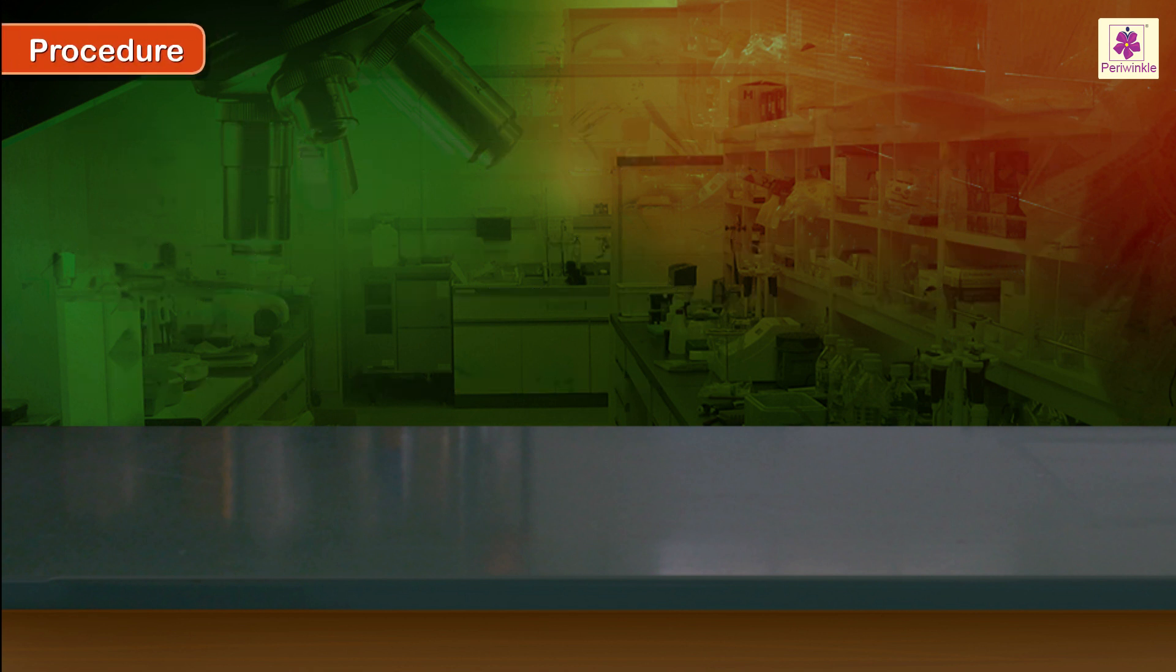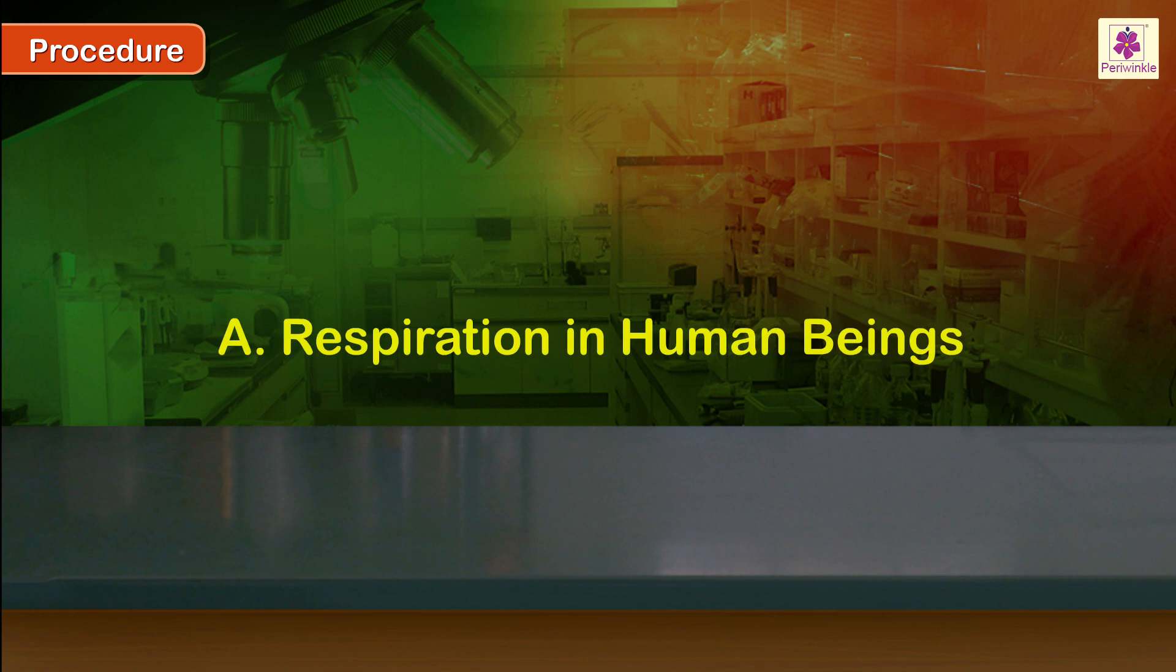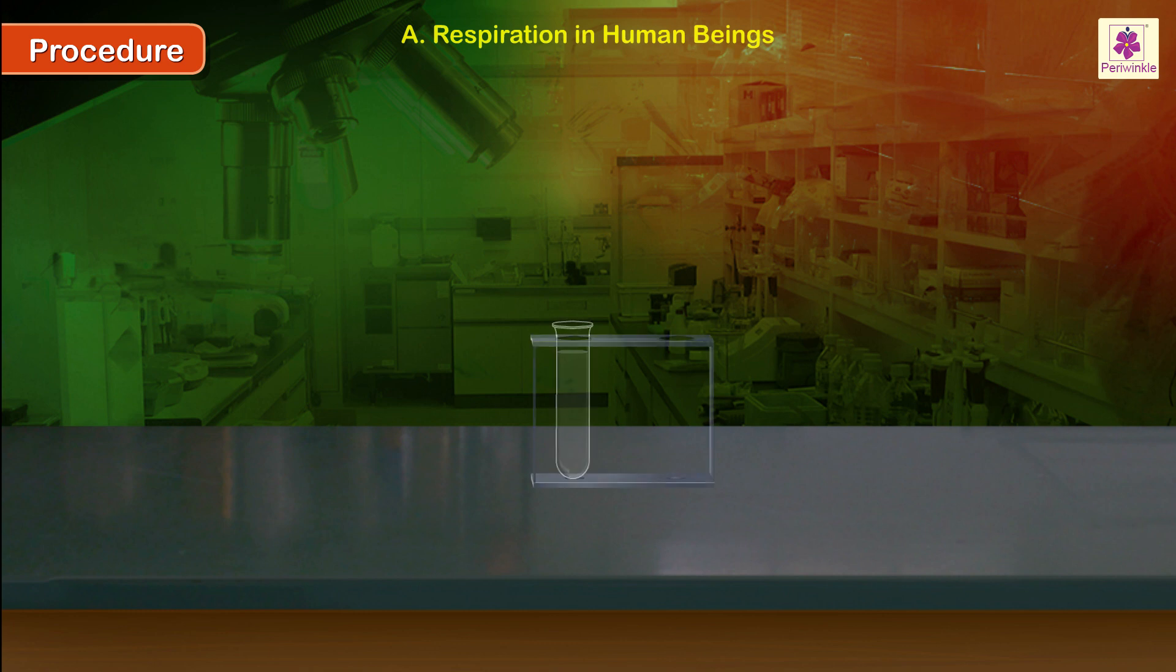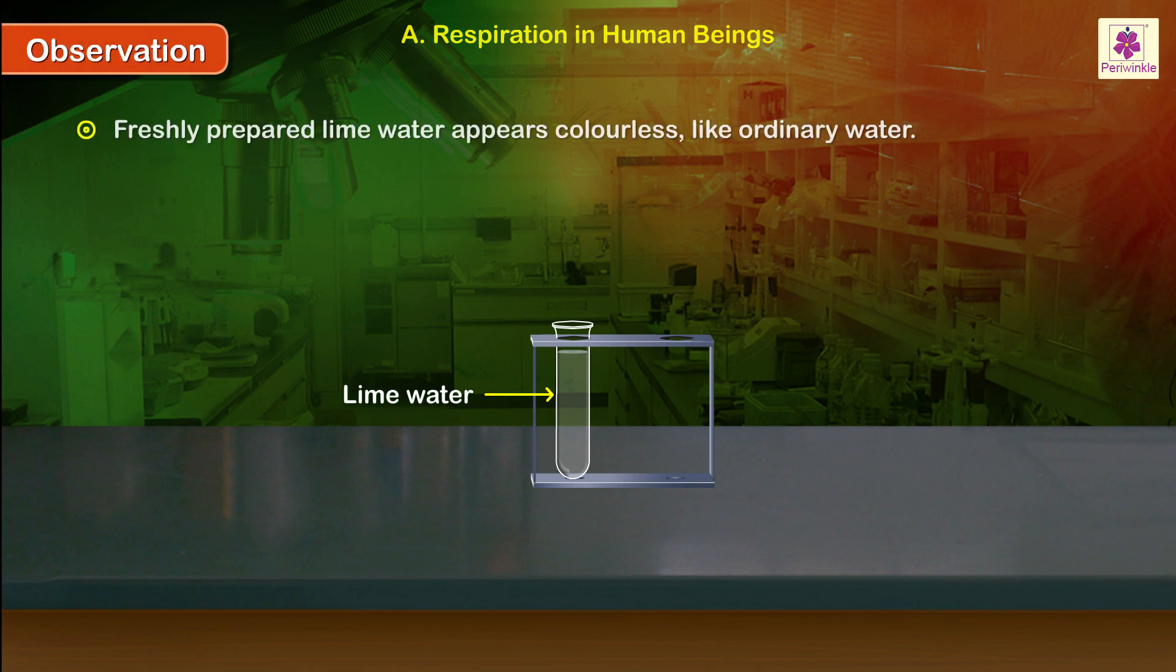Procedure A: Respiration in human beings. Take some freshly prepared lime water in a test tube. Observe and note down the color of the solution. Observation: freshly prepared lime water appears colorless like ordinary water.